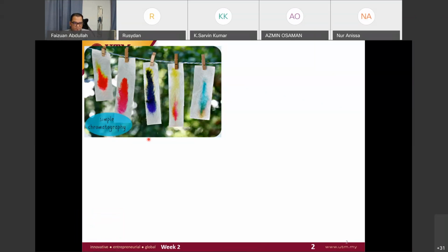Yes. Okay, you can see the first dot. Where is my pen? Sorry. Okay. You see the first dot was put here, and then it's moving up there. The first dot was red and then becomes lighter, and at the end it becomes yellow. And this one might also be red. I don't know which direction the coloring solution goes, this way or that way. But the color is changing, right? Am I true?